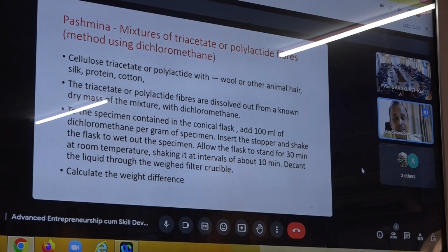Without preliminary analysis it may be Pashmina. Pashmina is a protein fiber, an amide fiber, and it is very difficult to detect blending. You know it is already adulterated with something, but you don't know how to find it. I talked to Dr. Asif, and he said you already have this apparatus. By using the standard method, you can determine the nitrogen content, and from that you can find out whether any adulteration is there. Normally this method is for jute and Pashmina. Jute contains 0.2% nitrogen compared to Pashmina, which has more than 10% nitrogen, and likewise for polypropylene or acrylic fibers.